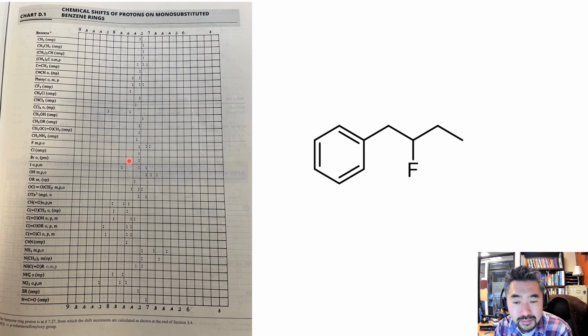So that chemical shift would be something like 7.5 ppm, whereas at the meta and para position it would be like 7.22 or something. That's why the ortho, para, and meta are separated here. There are 2 different shifts that you expect for a monosubstituted benzene ring. Okay, so that's sort of how you typically read these. The most affected proton usually is the ortho.